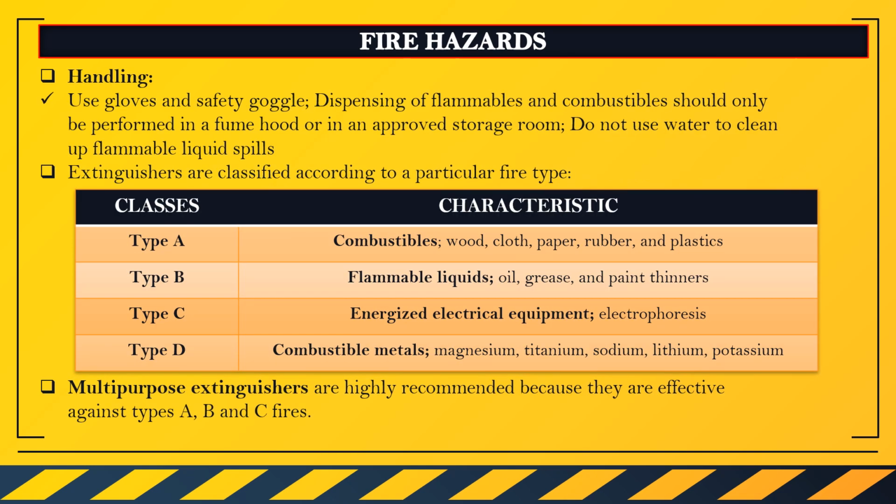Okay, for the handling of fire hazards, we need to use gloves and safety goggles. Dispensing of flammables and combustibles should only be performed in a fume hood or in an approved storage room. And we must also remember to not use water to clean up flammable liquid spills.